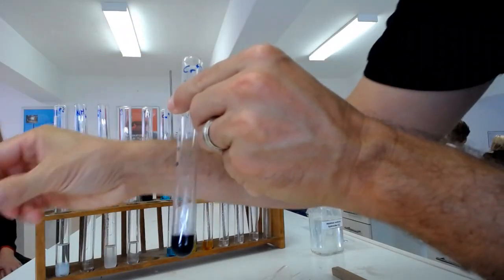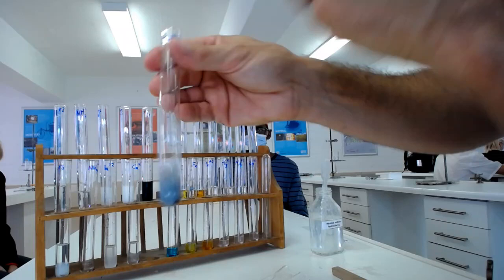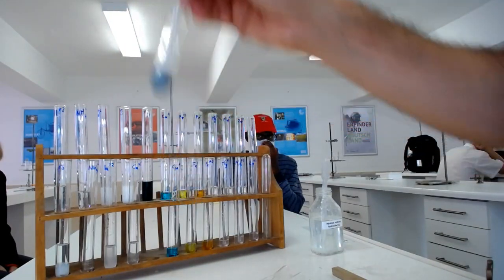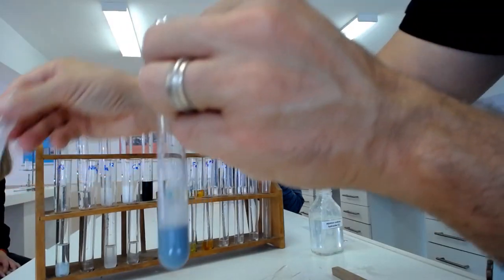So, right, let's look at ammonia and my chromium. What happens? It's also a gray-green precipitate. Oh, but do you see there's a slight difference? No, there's no difference. It looks exactly the same. What happens if I add an excess? It would be insoluble. Also insoluble.